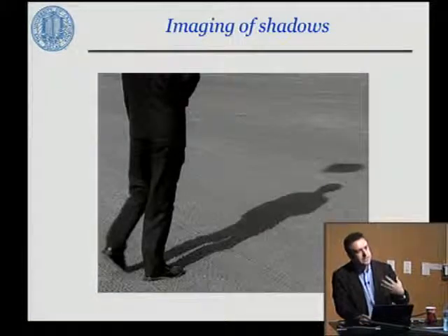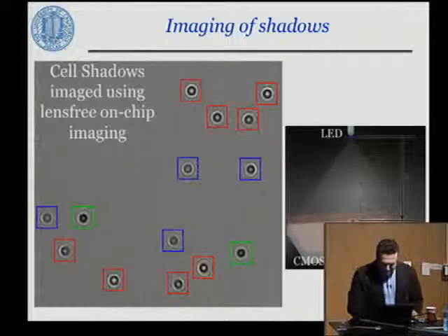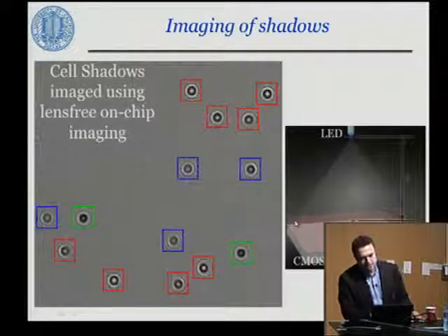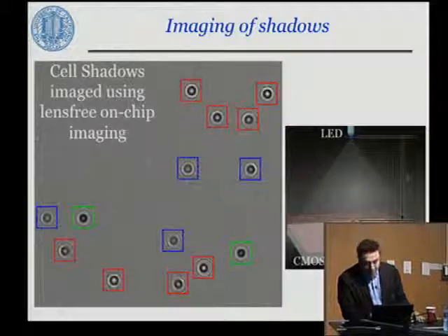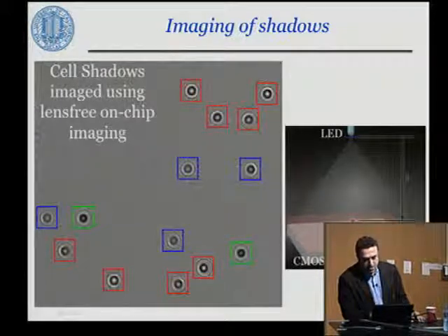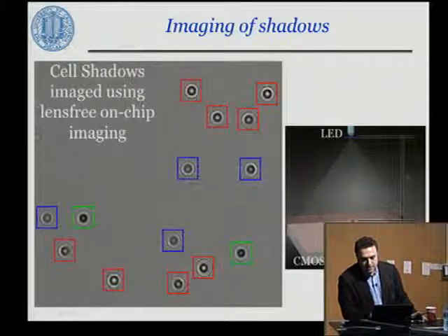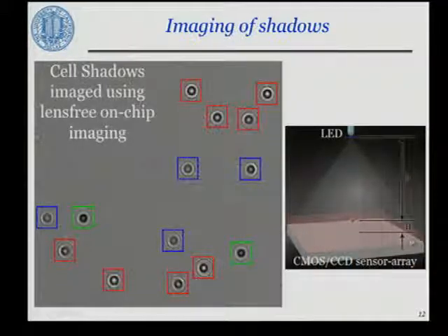As I've said, these kinds of microscopes are based on imaging of shadows. In a sense, if you have a CMOS imager or a CCD sensor array, you're looking at a certain active area dictated by the number of megapixels that you have and the pixel area. Typically, all of your mobile phones would fall in a range where this silicon chip here would be half a centimeter by half a centimeter. So typically, you're looking at 20 to 30 millimeter square area.